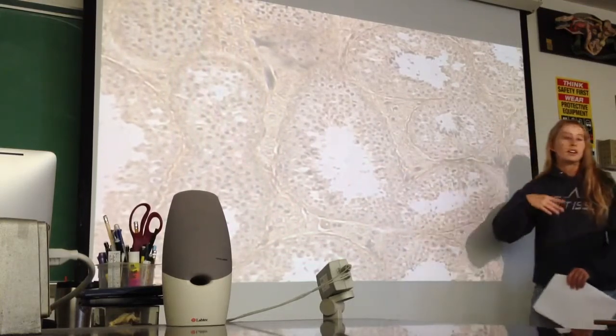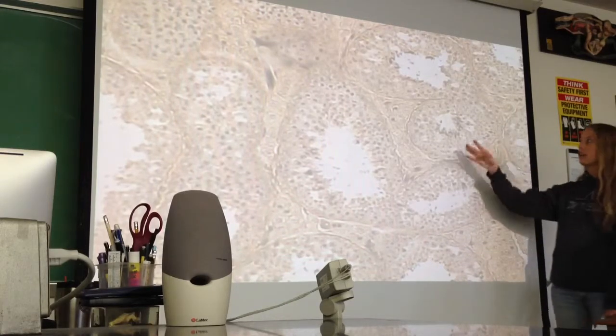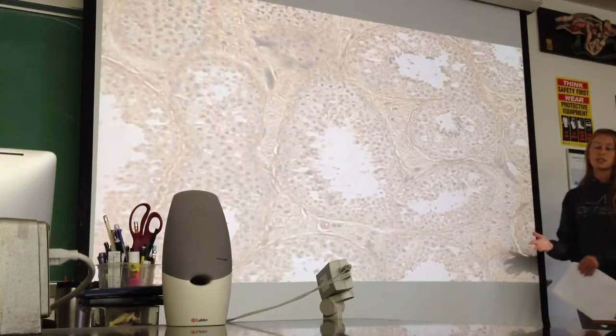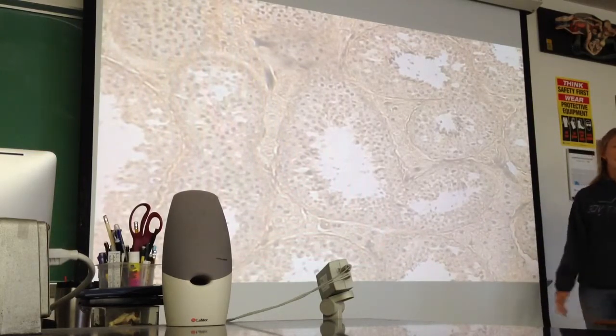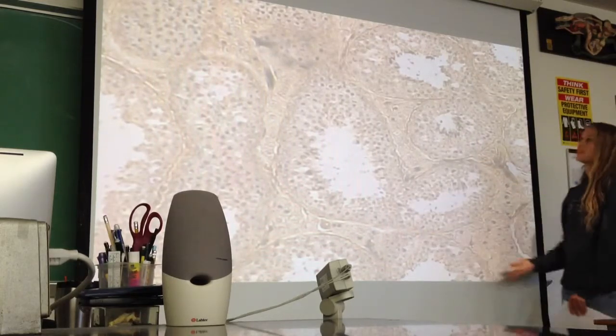If you ever take physiology or any other advanced reproductive classes, you're going to be looking at this a lot. I think it's so cool that you can get this much detail on a slide. We look at slides sometimes and it's like I can't even tell what I'm looking at, and then you see this and you can see meiosis. It's such a big difference in what you can see.